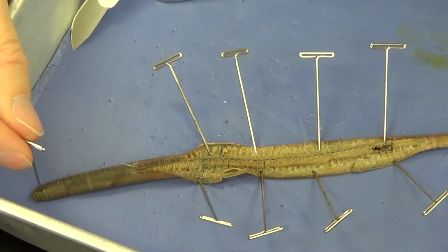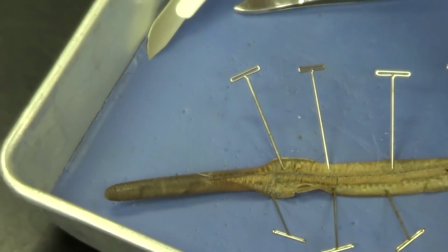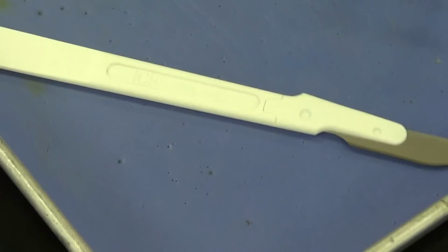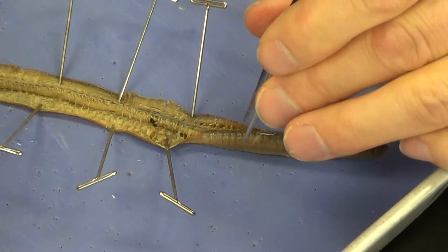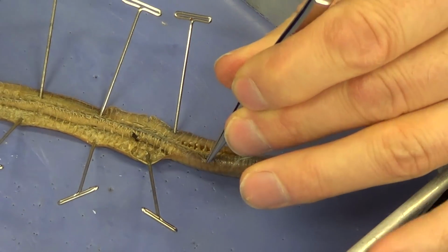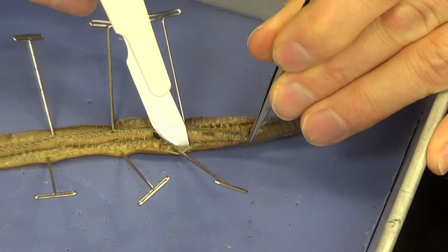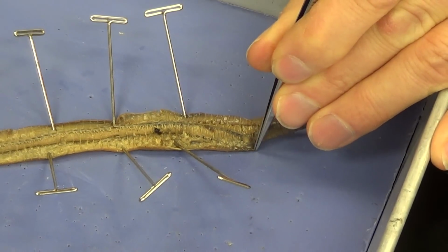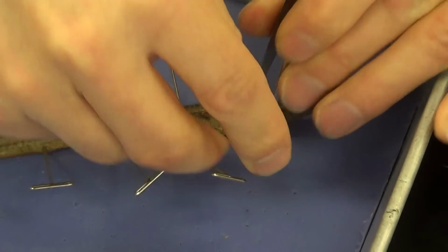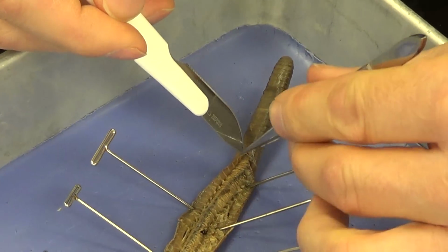Now eventually, as I get close to the mouth, I want to remove that pin so that I don't bump into it. I'm going to turn the pan again, and I just go back and forth until I complete this. So I'm going to reflect the skin a little bit here and cut those septa. Go ahead and I'm going to pin this. And I'm going to continue my way towards the anterior.